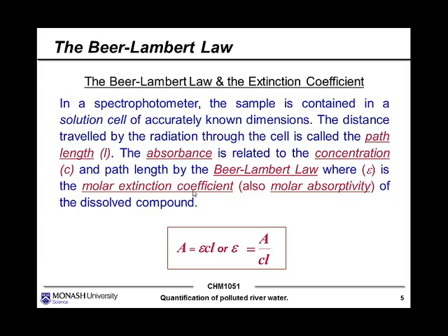One important point I'd like to make here is that when absorbance values start getting quite large, and by large I mean getting towards a value of 1, this linear relationship starts to fall out. So in good practice, we like to keep our absorbance values approximately in the range of 0.1 to 0.5. If you're outside or inside this a little bit, that's okay, but it's most important to keep the absorbance of our standard solutions approximately within this range.